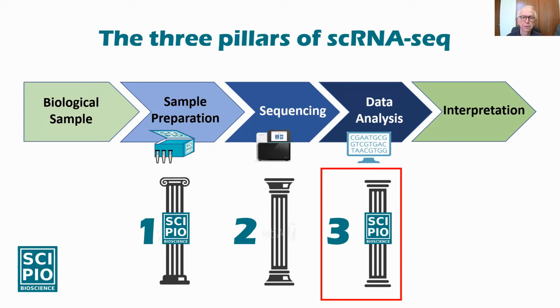As we began working with our own equipment and cells and our own collaborators, we discovered that, in fact, the day's work to produce an experimental result was straightforward, but depending on the subject, the data analysis could take many days, even weeks, and it could go almost on forever, because whatever you're looking at, you can always go into the subject more deeply. So that was where we decided that we also needed to put a significant effort into the data analysis part of our offering. And that's what I'll talk to you a little bit more about now.